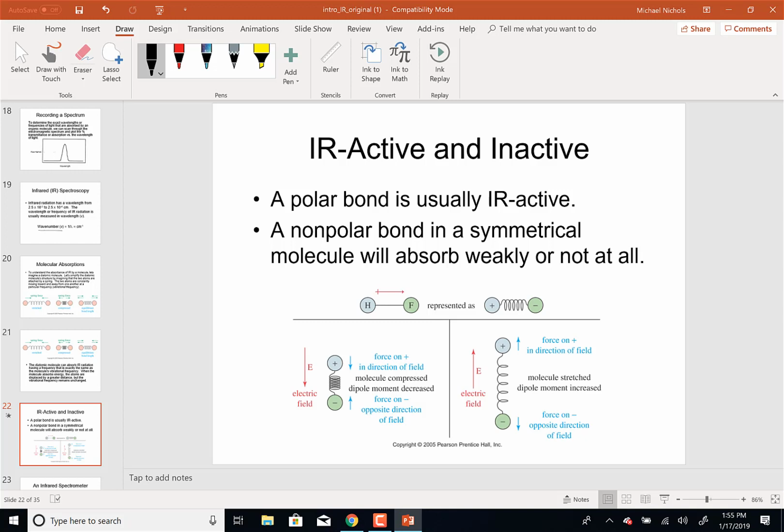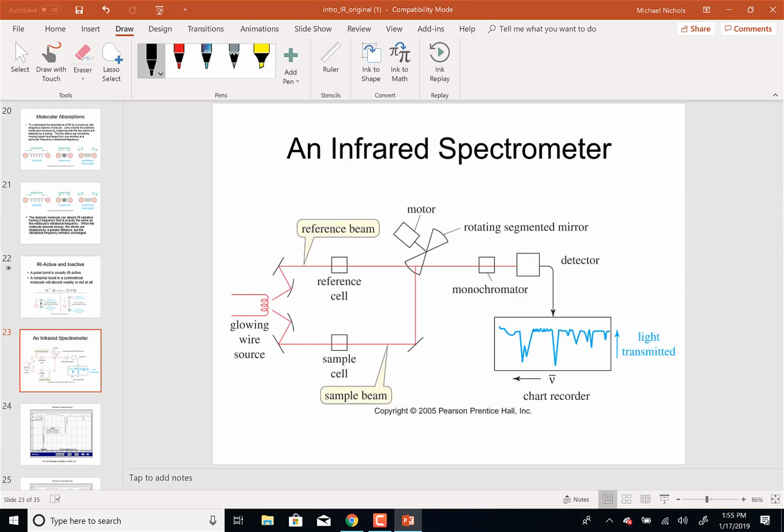So the idea here is that molecules, whether they're stretching their bond or whether a CH3 group is going like this, they're changing their dipole moment, and that frequency then is in the infrared. And so a particular wavelength of light will cause that molecule to have energy absorbed. But each one of those vibrations is different, so it shows up on a different part of the spectrum. Okay? So I've just given you an infrared spectrometer.